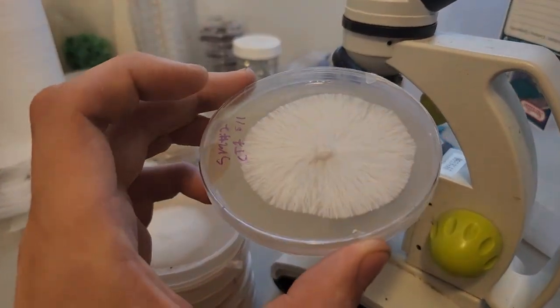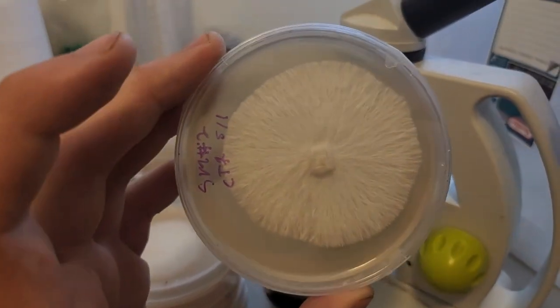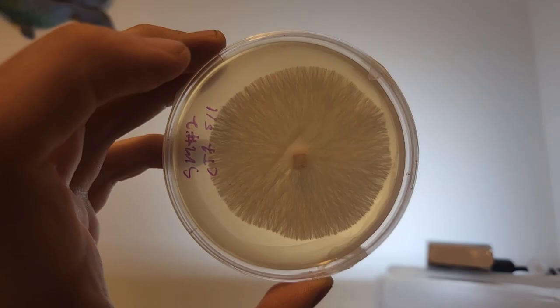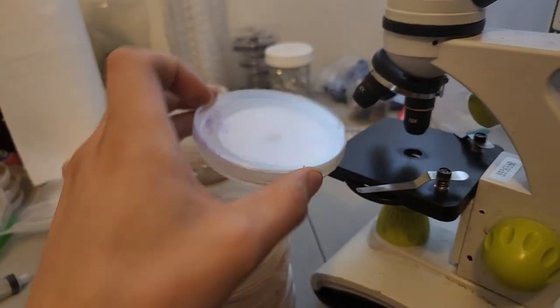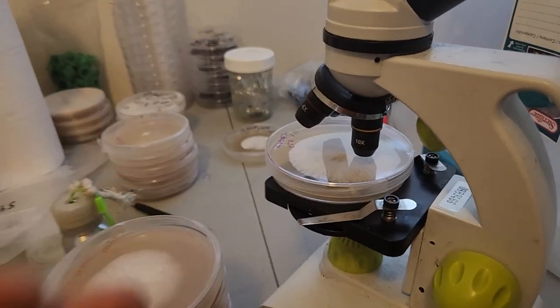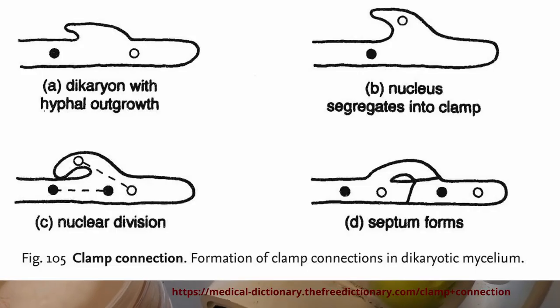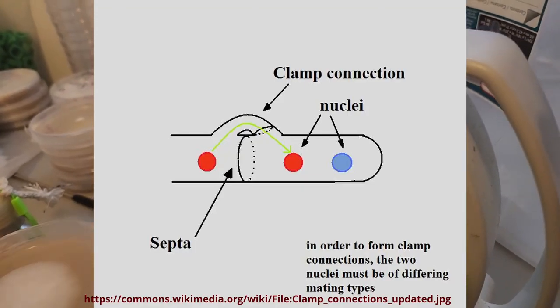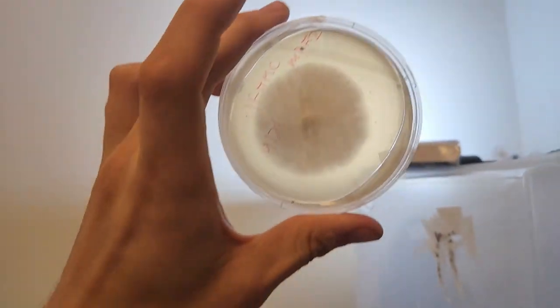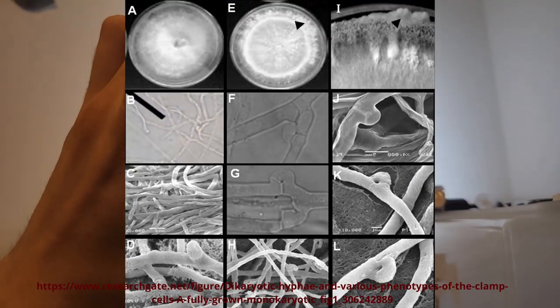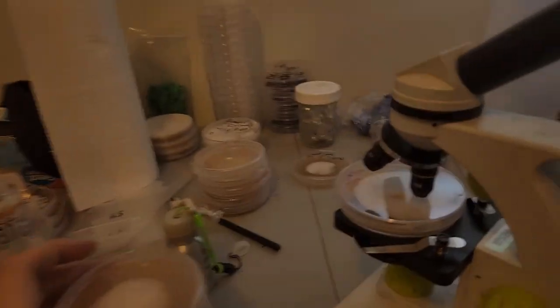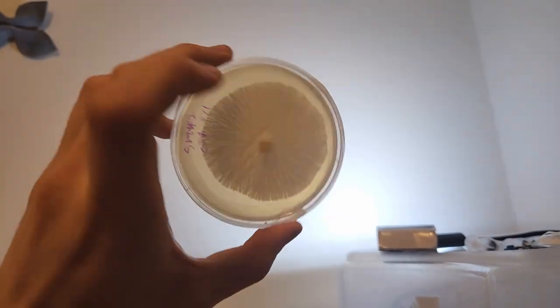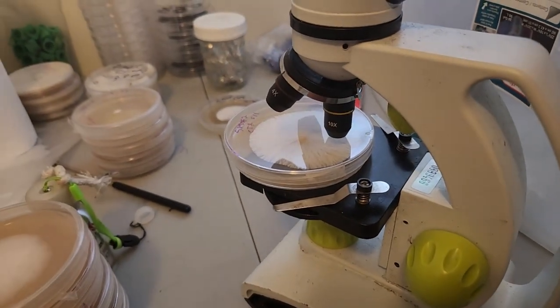So what I like to do to get started is have a dikaryotic plate. As you can see, nice rhizomorphic growth. This was taken from a clone. I can guarantee it's dikaryotic. And I'll just put that on my scope just so I can get a feel for what the clamp connections look like. If I haven't done this in a while, it just helps me differentiate, because when you're searching for monocaryons, you're searching for the lack of something. So you've got to spend like 10 minutes looking around, and if you don't find anything, you just kind of have to assume. So it helps to train your eye on a dikaryon, just so you can spot clamp connections a little easier.